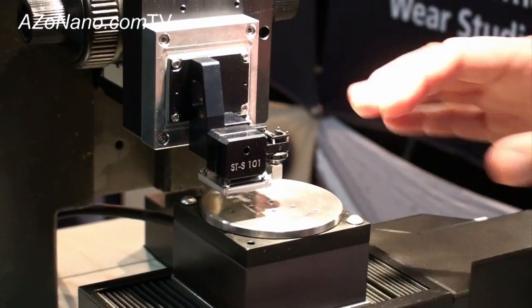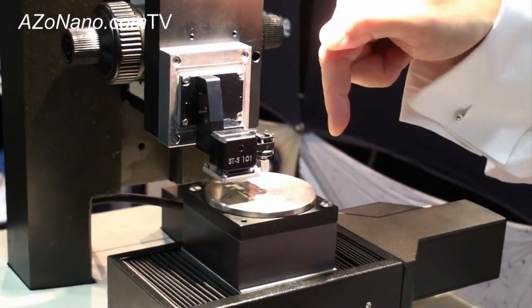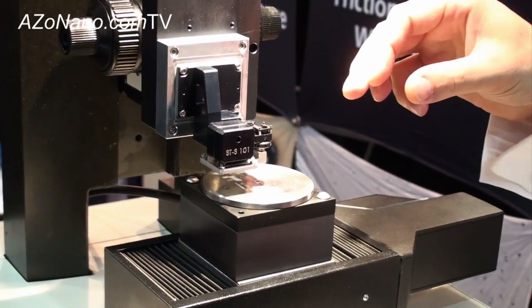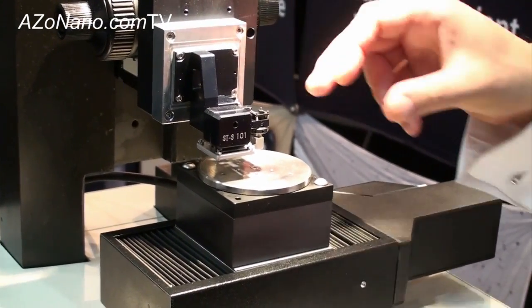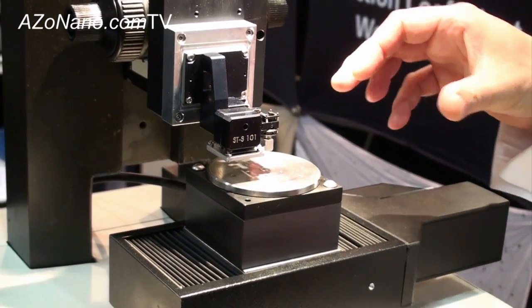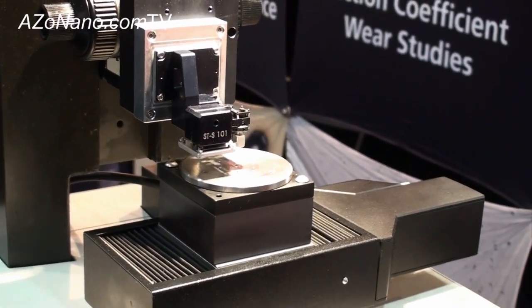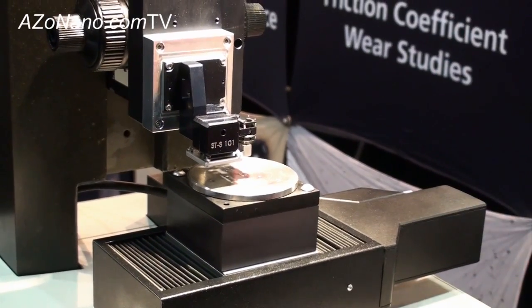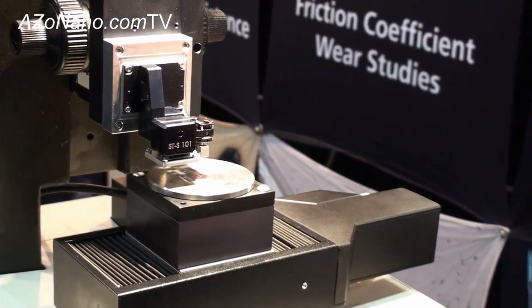In terms of sample movement we have a rotating table here so we can do pin on disc tribology. We can also put a linear reciprocating table on here to do reciprocating tribology. This type of machine really bridges the gap between AFM based tribometers and macro scale tribometers, with loads in the micro to millinewton range.